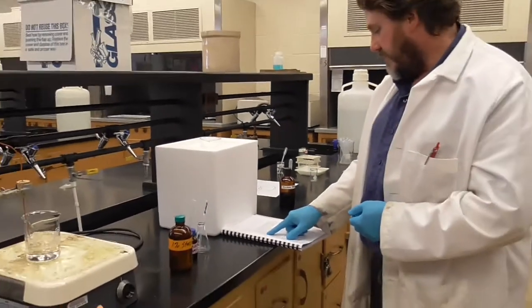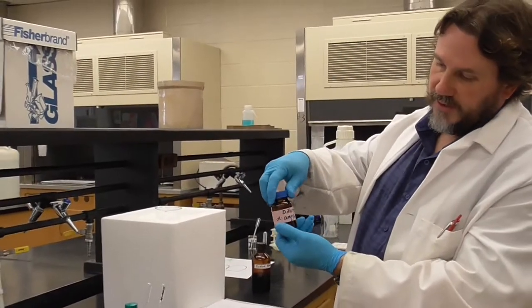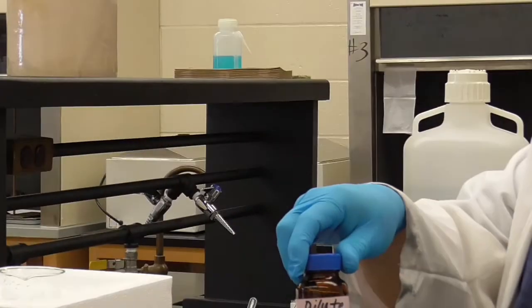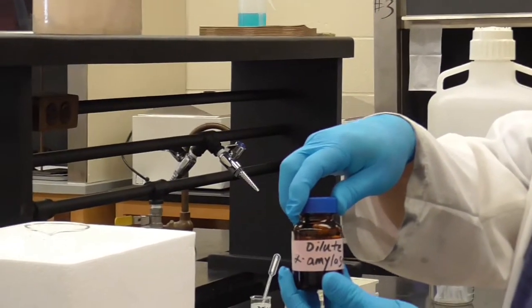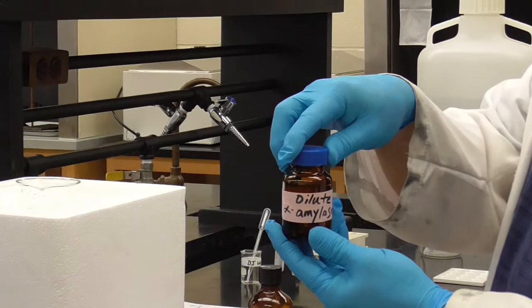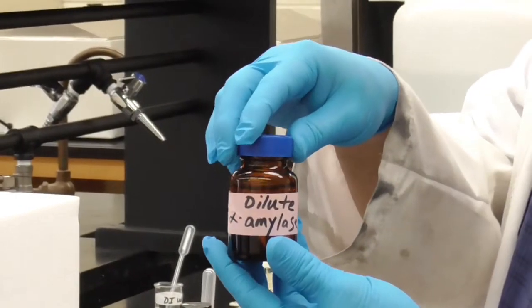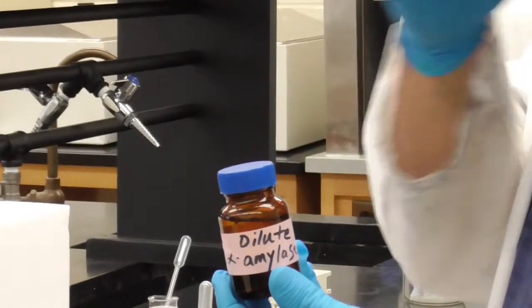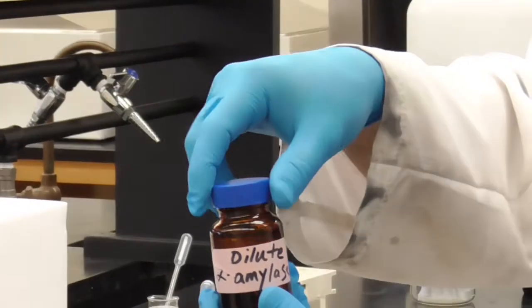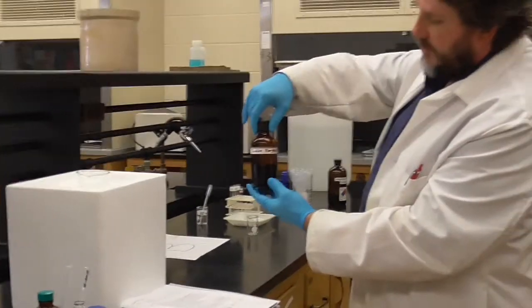Step 3 says get the amylase solution. And here we go. Here's our solution of amylase. It's already been diluted to the correct level. All right, alpha amylase. So this is the same enzyme that's in saliva. In fact, you could do this lab without actually pre-purchasing amylase. You could use your own saliva, although that might be a little weird. But you could do it because that's where this enzyme comes from, and that's where it's naturally found in both you and me.